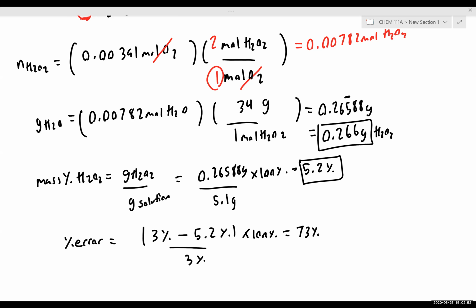But then again, with the setup we were using, if we had a more accurate method of measuring the volume, and if we had a way to purge any of the gas remaining in our graduated cylinder, we probably would have an easier time getting accurate volume readings for our sample.